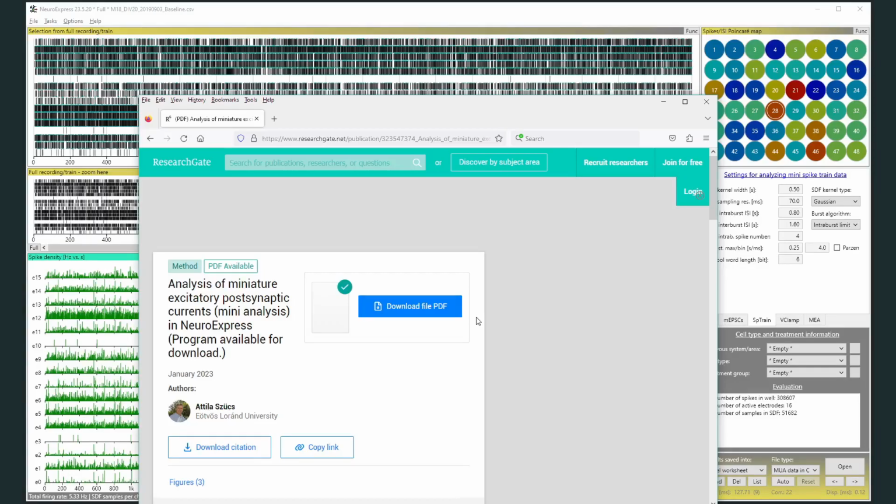You can unzip, uncompress this file and copy it into a directory like under Program Files, and then you are ready to start and run the program. It will not require anything else like a runtime library or some additional component like a Python environment or MATLAB. It's a standalone executable, and you can use it immediately after downloading.